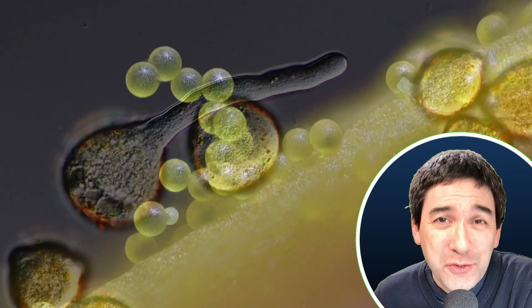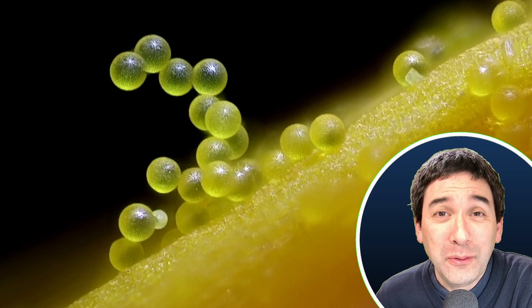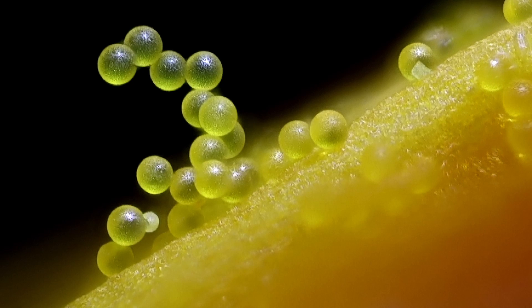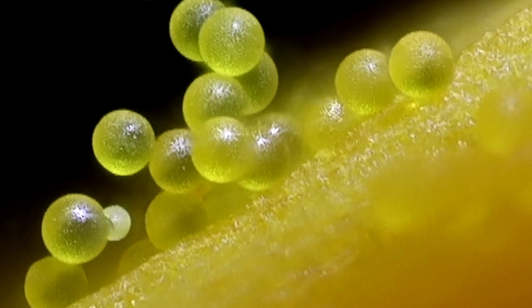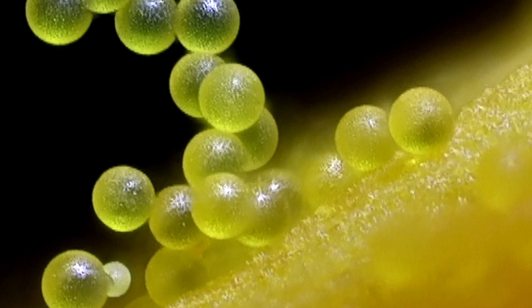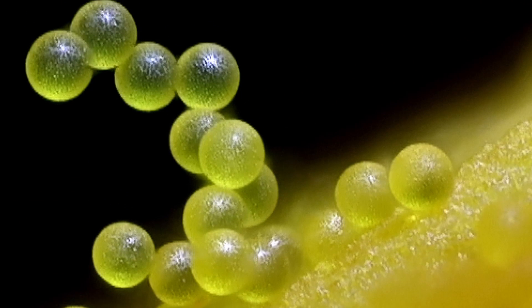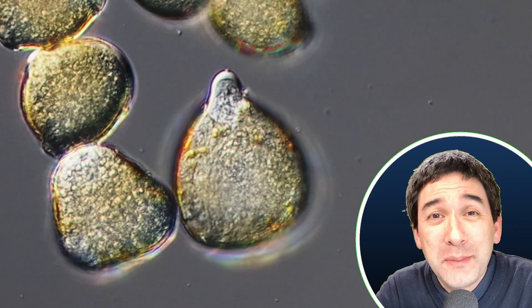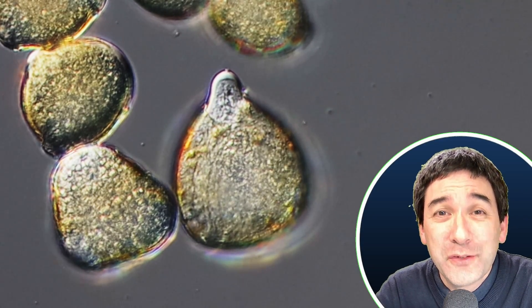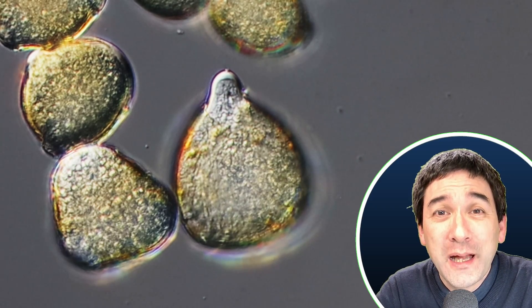A few years ago, during springtime, I collected some pollen and put them under the microscope. And not only that — I added a little bit of sugar solution to the pollen, and then I could actually observe that some of these pollen started to grow a tube, the so-called pollen tube. At the beginning, the pollen tube is still very small, barely visible, but after some time it can become quite long.